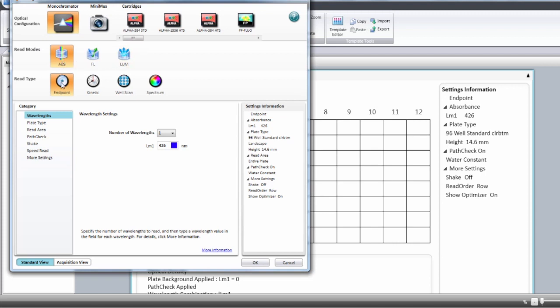The read type is going to be either an endpoint, kinetic, well scan or spectrum. Here we're going to select endpoint.